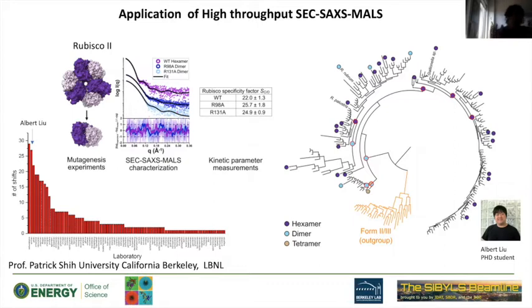But if you have different mutants or constructs for different proteins or complexes, if you're interested, you're welcome to send more than 2, 3 samples. So far, the limit is about 7, I believe, on our mailing page to give in one slot. If you want to have more, just ask Catherine and we'll discuss the possibility to give you 2, 3 slots. I mean, there's no limit if there are open slots for the users.